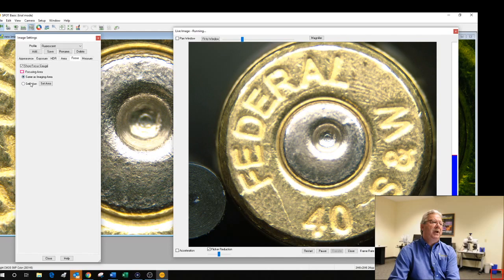Under that focusing area in the pink box, there's also something that says selection, and right next to it, it says set area. I've got a regular cursor right now, and when I go in to hit set area, it says I can click and drag the mouse.